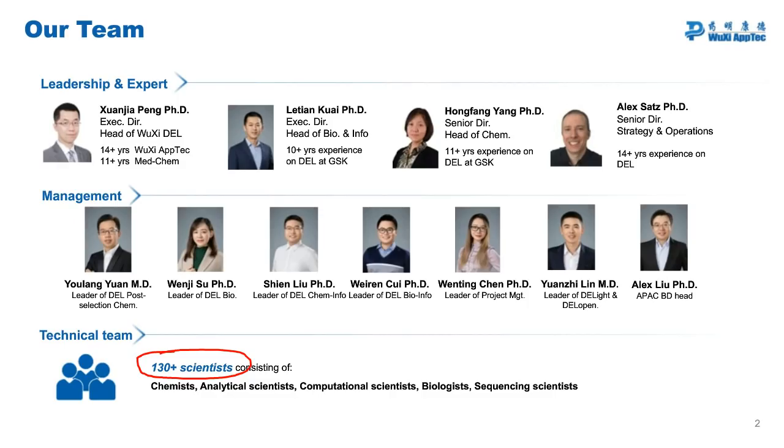What is the typical affinity that you find in a DEL hit? I feel as though that is dependent upon the target more than the DEL screening. I would say that hits that we consider useful tend to be either single-digit micromolar or more potent. Can we find hits that are less potent than that? Probably yes, but in the end, for the follow-up assays that we normally use, if they're not single-digit micromolar or better, usually no one has an interest in those kinds of hits.